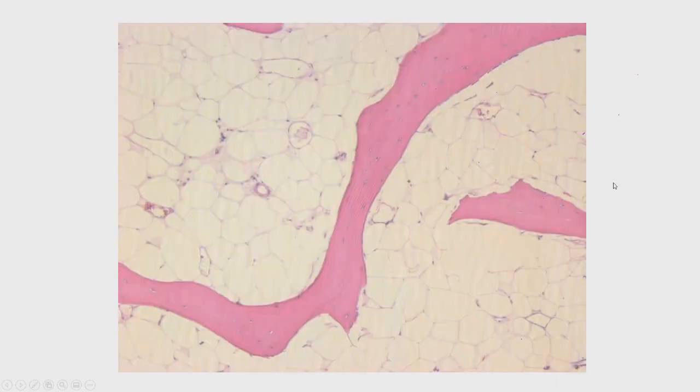And this last slide here, I know you're saying, great, we've seen enough. But this is the last slide that I'm going to show you of this bone marrow, but I really wanted to show you this because the preparation on this was pretty optimal.